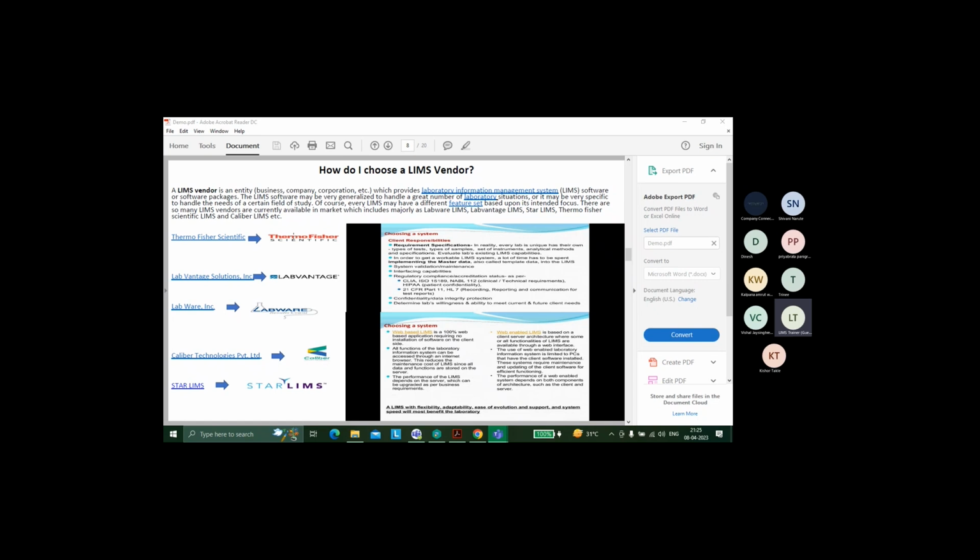So going ahead, maybe later we'll discuss, there are a lot of examples where some LIMS companies have those functionalities. Some LIMS companies say, okay, no, we don't have that functionality. We'll do something else here. We'll do some other tweaks. So one is user friendliness. The other is customizability. How much you can customize, how much you can mold your LIMS to meet your requirements.